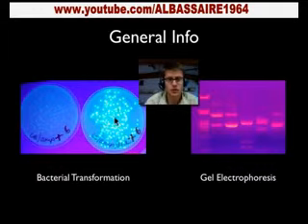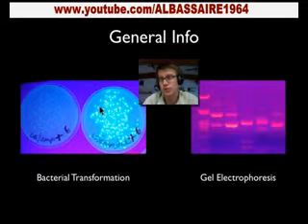In this picture right here, you can actually see E. coli bacteria that's growing on a plate. It's growing on some lauria broth. And so in each of these cases, you can see something different. And so this would be normal. This would be under ultraviolet light. These ones are producing a glowing protein, so they're glowing. That was actually extracted from jellyfish. And so that's going to be the bacterial transformation part.